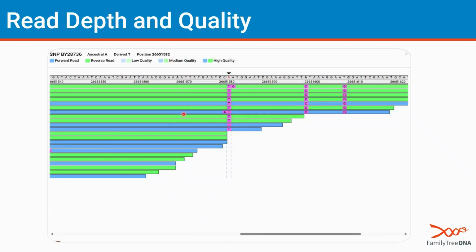So here's an example of a read that doesn't have the best read depth. You can see that in this one, it was only covered a few times. But every time that it was covered, it was positive for that SNP. It got a nice clear read. So that's important. And that can verify that I'm positive for this SNP.